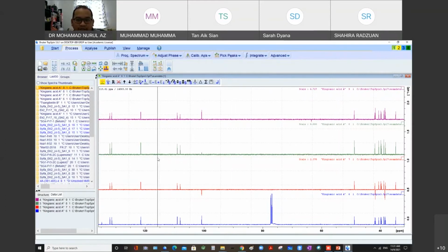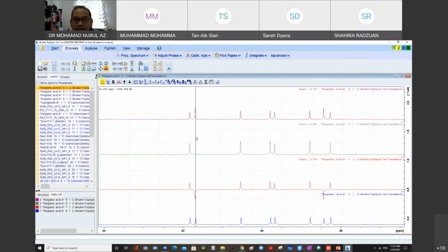So for that 19, how many CH2 do you have? 1, 2, 3, 4, 5. CH, 1, 2, 3, 4, 5, 6, 7, 9, 10, 11, 12.